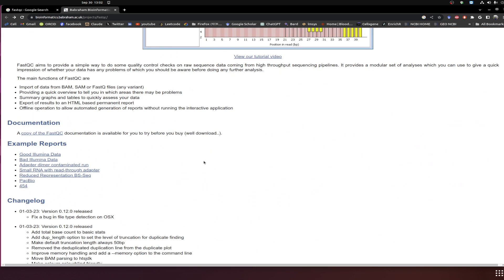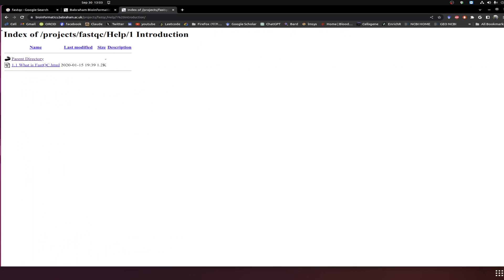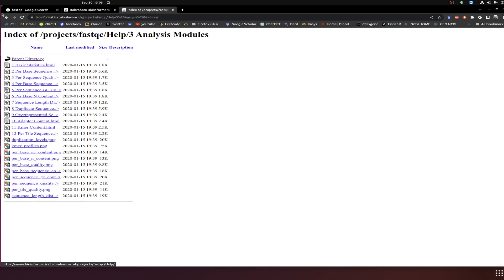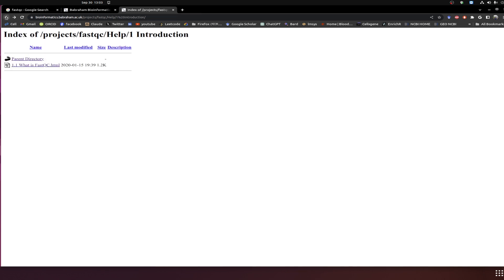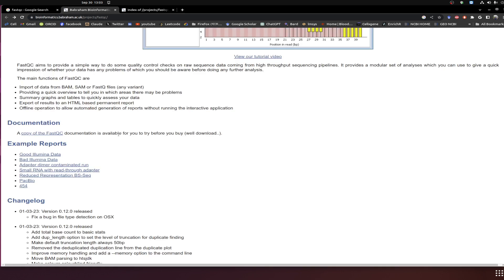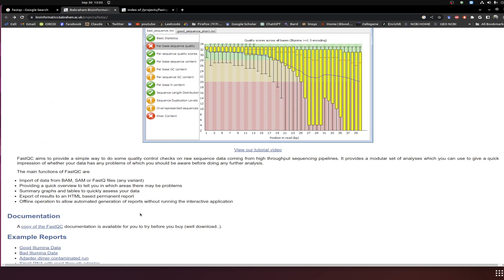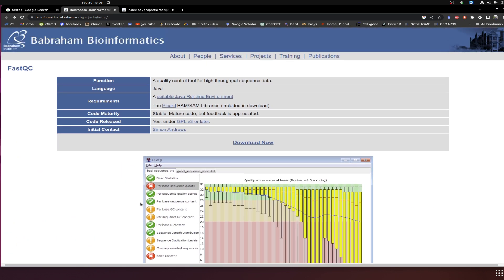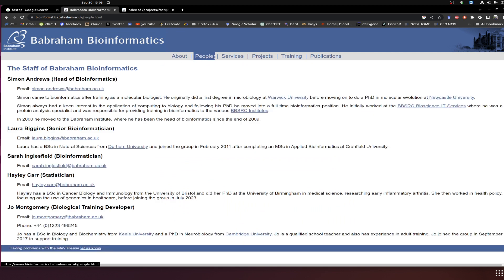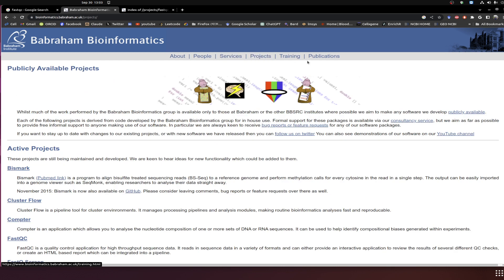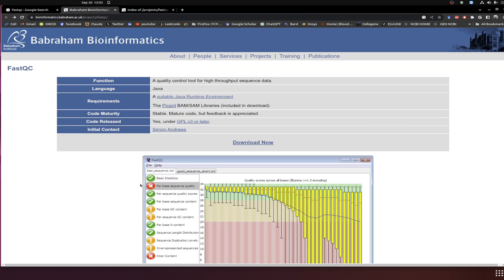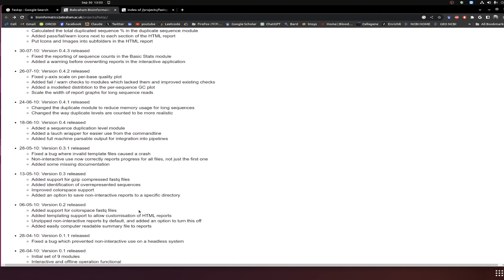For detailed information, you can go to the FastQC documentation where you can look at the introduction, basic operations, and analysis modules, each in detail. It's well organized and they did a very good job with it. If you have an issue, you can contact the people at the Babraham Institute through their listed contact information for consultancy or active projects.